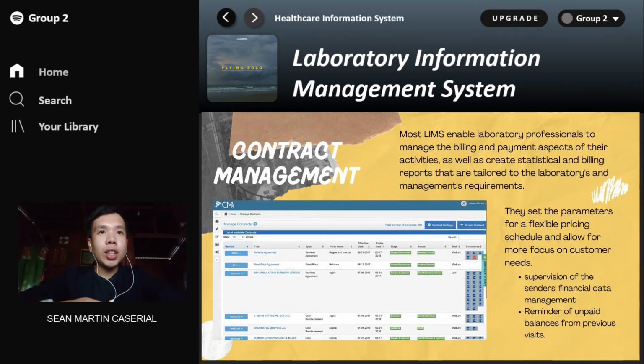So we are now in contract management. So most LIMS enable laboratory professionals to manage the billing and payment aspects of their activities, as well as create statistical and billing reports that are tailored to the laboratories and management's requirements. They set the parameters for flexible pricing schedule and allow for more focus on customer needs. So what is this contract management? This is what we call the process of maximizing the procedure for customers' needs while reducing the cost of it. So it includes the supervision of the sender's financial management and reminder of the unpaid balances from the previous visits.